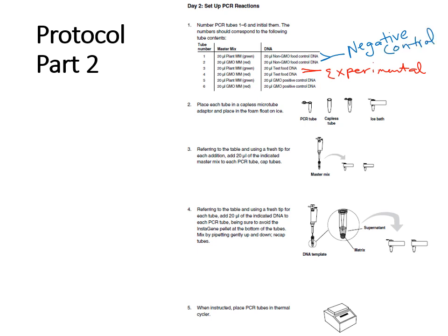And then you would have your GMO positive, which, as the name suggests, would be your positive control DNA.